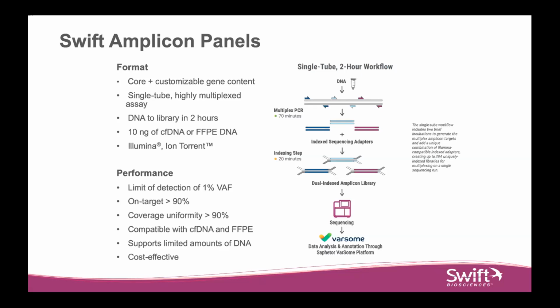And so these are metrics that confirm that you're amplifying only the regions of the intended genome that you wish to, and also that across the different regions that you are amplifying, for example, these amplicons, dark blue, light blue, and purple, they're relatively evenly represented within each sample. You don't want to have one particularly dominating or dropping out.